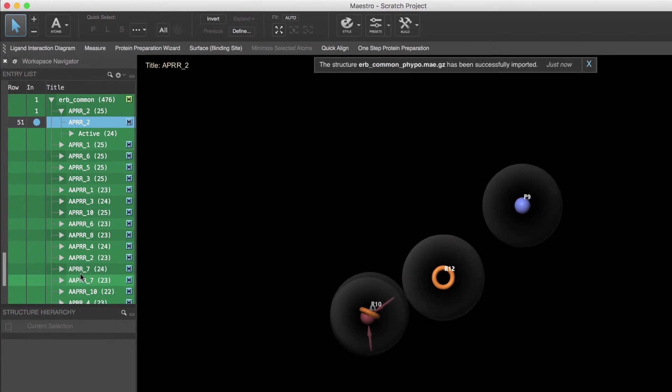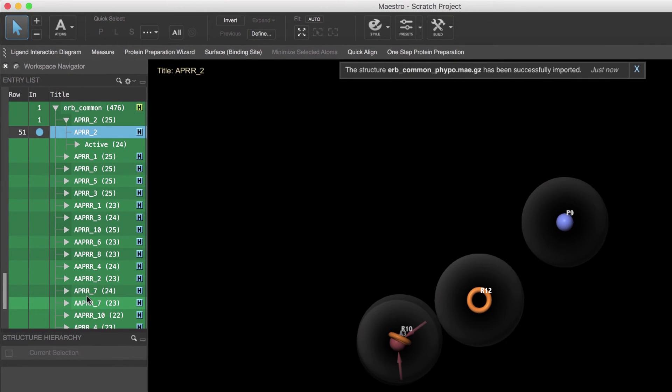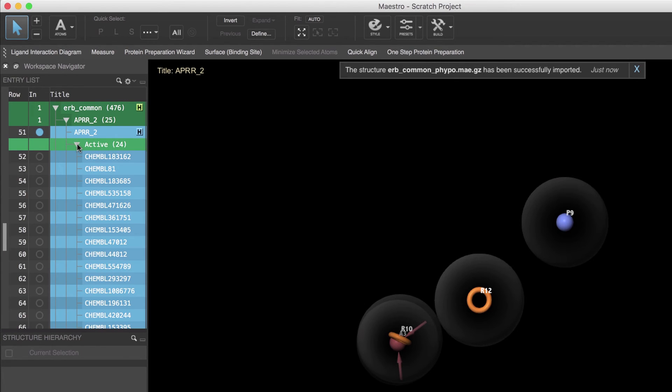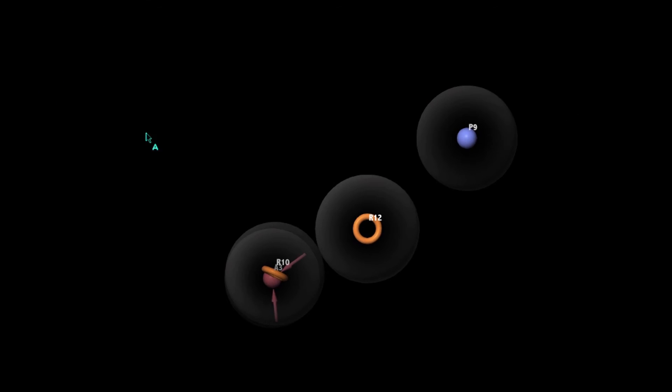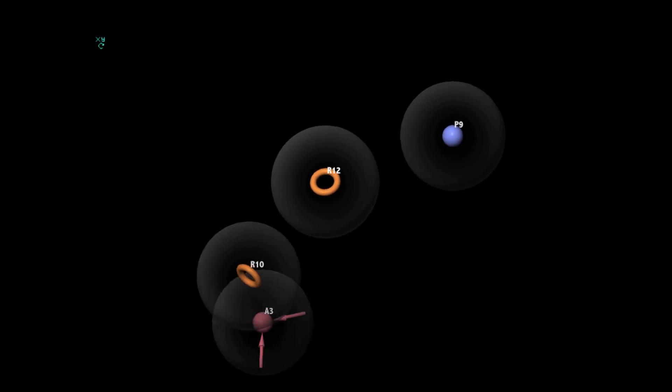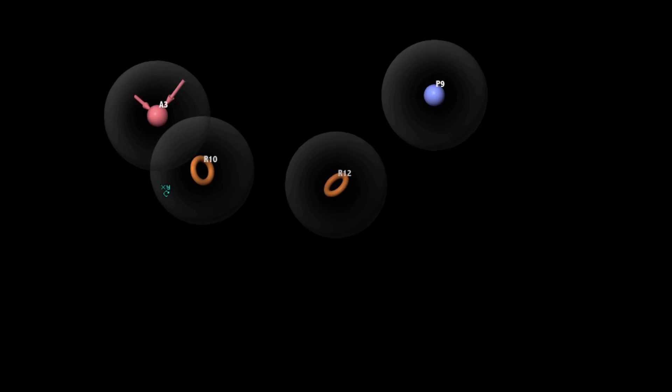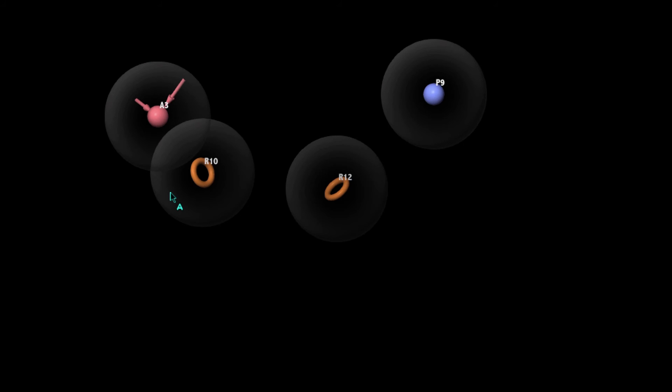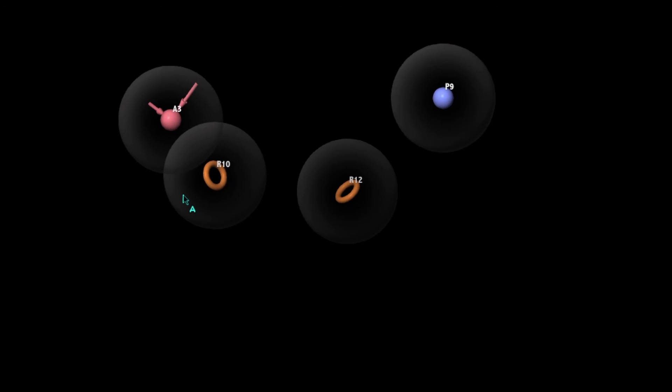Each hypothesis is shown as a group that contains the hypothesis entry and a subgroup with the aligned active ligand structures. The top ranked hypothesis contains four features: one acceptor, one positive ionic, and two ring features.